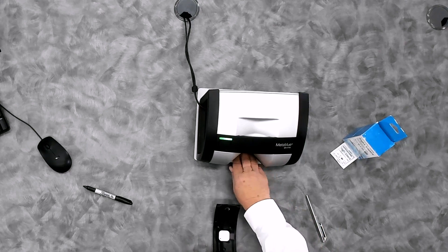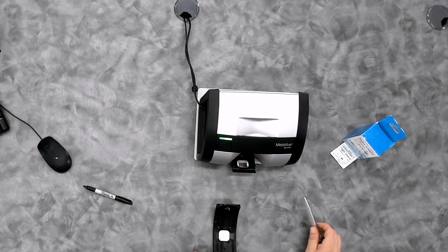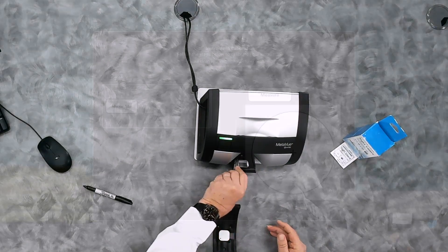If I slide this forward — it's locked into position — and I take this pen and just place it over the hole, you'll notice that the measure button goes away. So we need to make sure that the calibration plaque hole is visible and cleaned. Once it's visible, the camera sees it and we're able to calibrate.